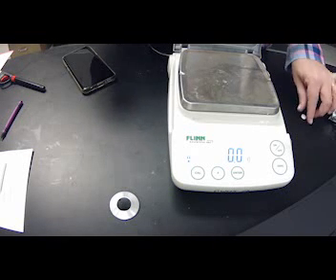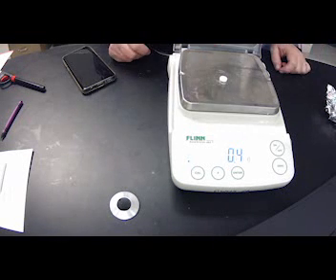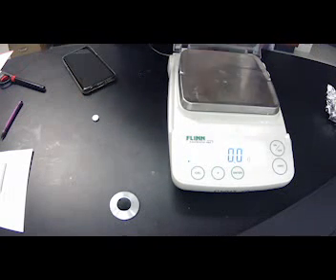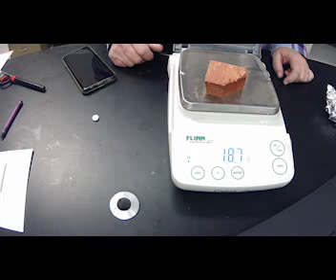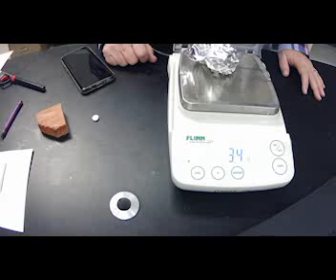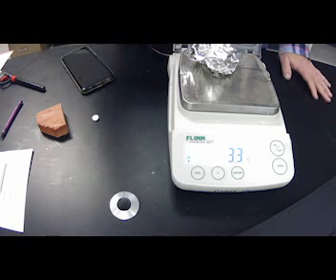So the mass of our aspirin is 0.4 grams. The mass of our wood is 18.7 grams. And the mass of our aluminum is 3.3 grams. For the molar mass, you're going to look up, of course, the atomic mass for each of those. And you do have on your sheet the molecular formulas to figure out the molar mass of everything there. And then you're going to calculate, turn those grams into how many moles. And then you will answer your last question, number 1.